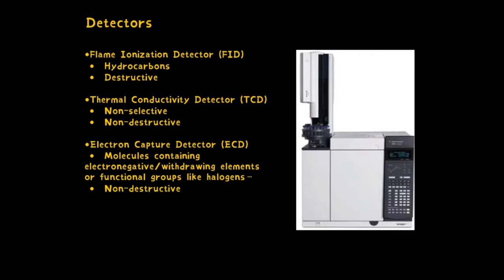Detectors should be chosen based on the characteristics of the target compounds. Quantification of environmental samples is complicated and different from pure samples because environmental matrices are complicated. They have not only our target compounds but also other compounds in them. So sample preparation is very important. For example, for liquid samples, liquid extraction and solid phase extraction can be used. For solid samples, accelerated solvent extraction and microwave-assisted extraction can be used to extract the target compounds from the matrix.